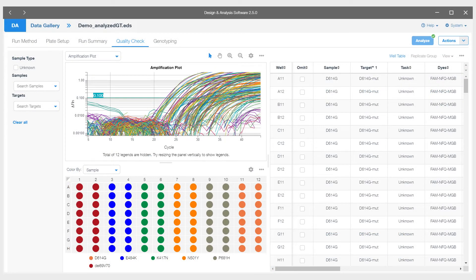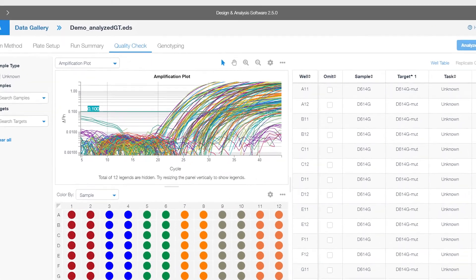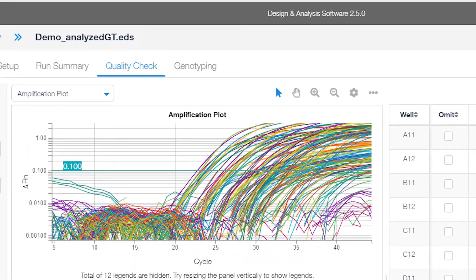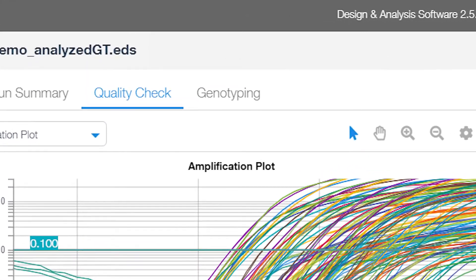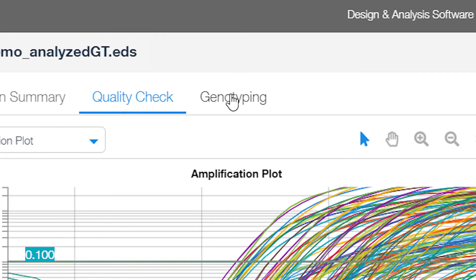The first tab open is Quality Check, where you have all of the different amplification curves. The tab we will use for analysis is the Genotyping tab.